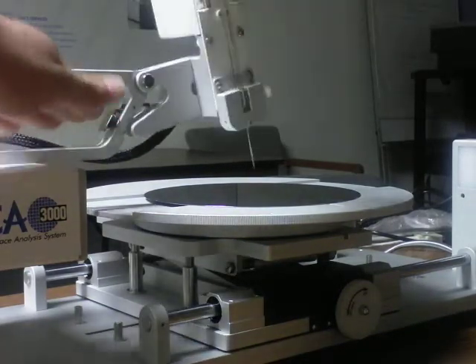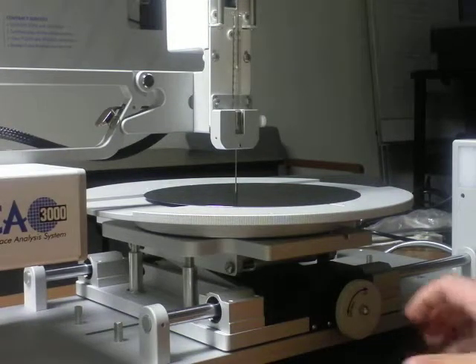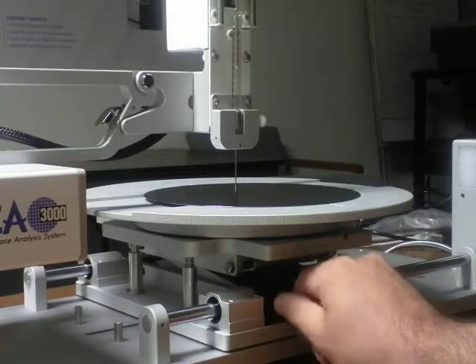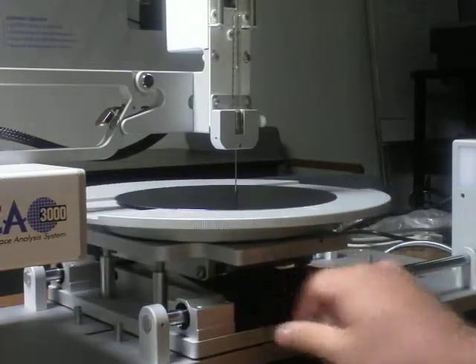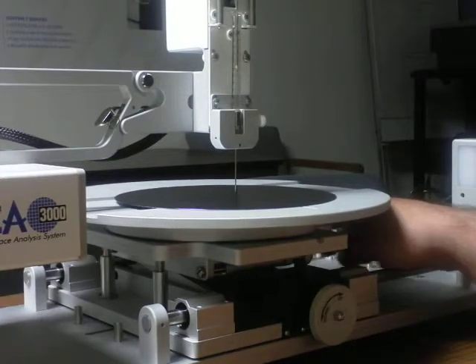You are then able to place it back in the correct position. The stage moves horizontally, back and forth, and also the stage itself will move side to side.